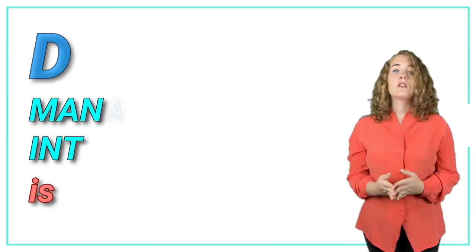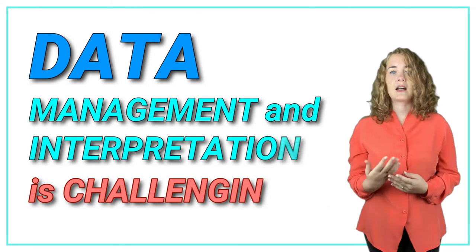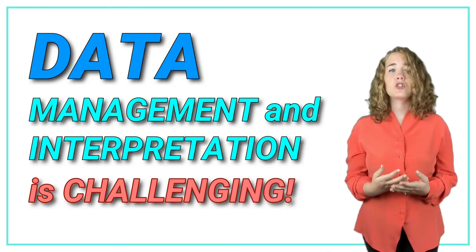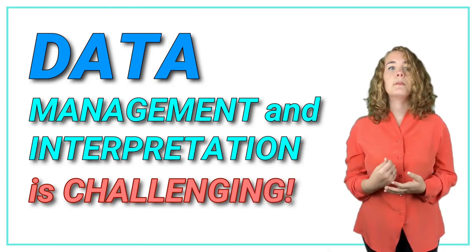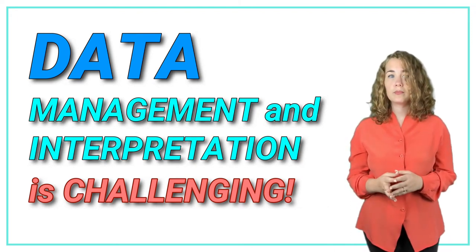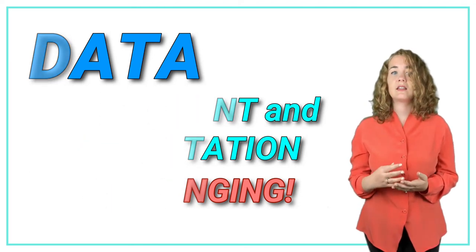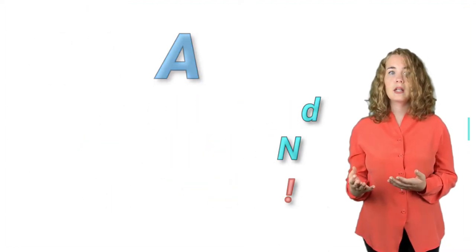Detecting alterations is pretty straightforward, but due to the high number of mutations carried by cancer cells, the management and interpretation of data can be very challenging, especially when sequencing the whole genome. In this case, the VCF file will contain several tens of thousands of rows.